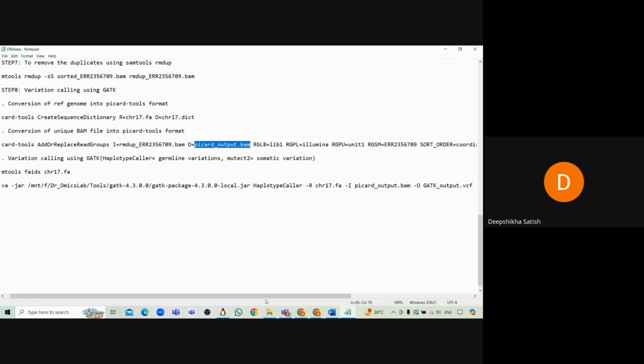That's haplotype reconstruction. Then for each haplotype, the algorithm calculates the likelihood that the observed reads would have come from that particular sequence. This involves factors like quality and probability of errors. That's the likelihood calculation.